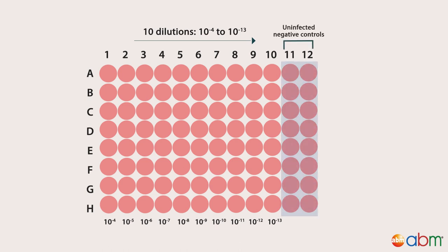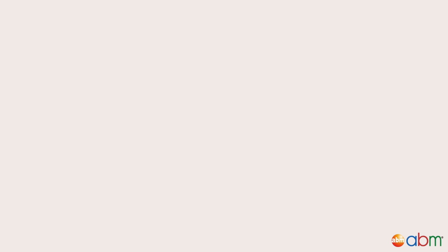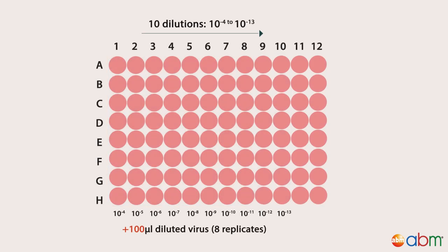For uninfected negative controls, add 100 microliters of fresh complete media to each well of the last two columns to measure uninfected cell viability. Next, carefully pipette 100 microliters of the diluted virus to each well of the corresponding column on the 96-well plate — 8 wells per column, which equals 8 replicates. Each column of the plate should be infected with the corresponding dilution.